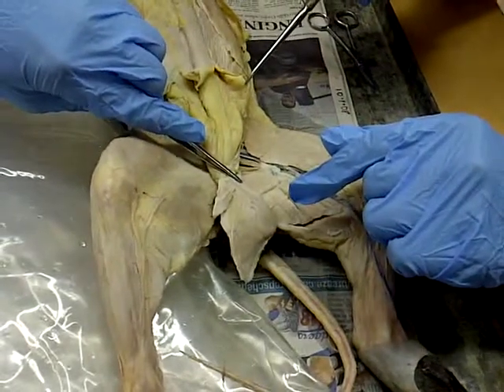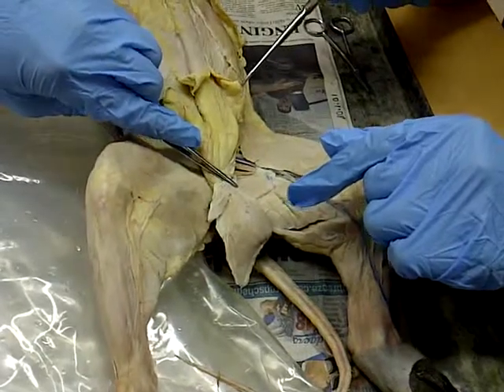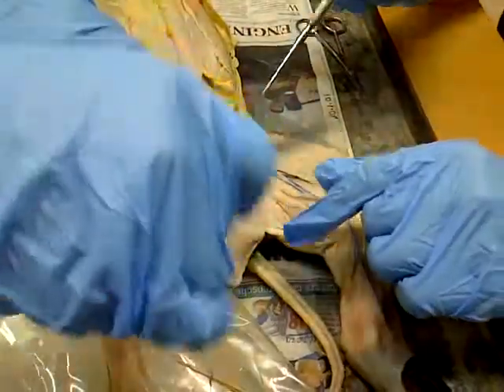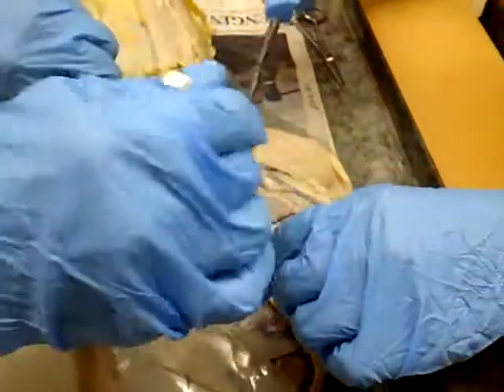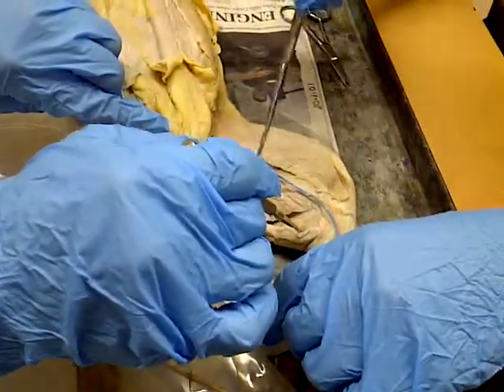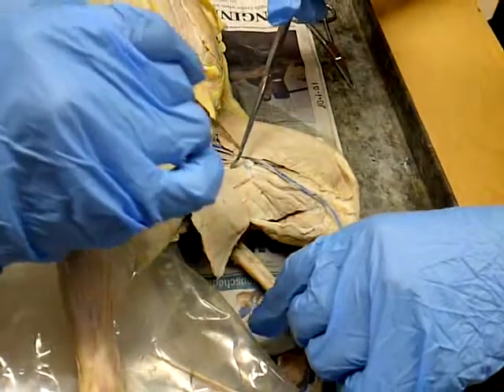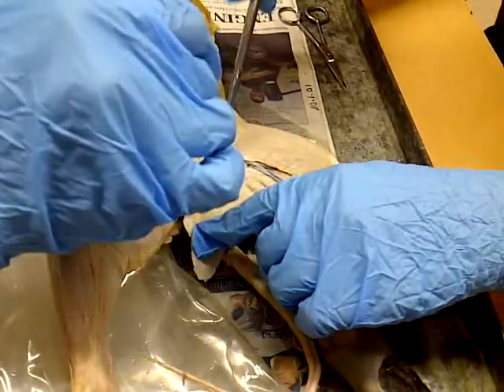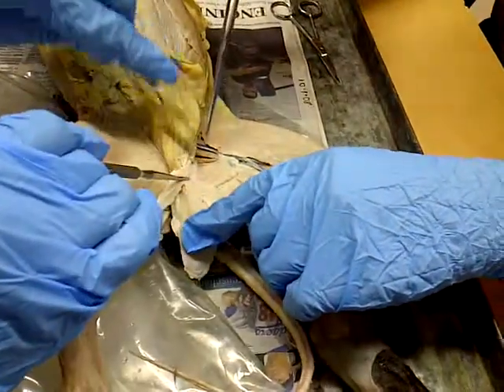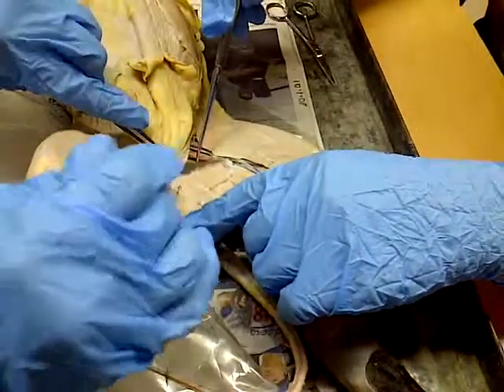Are we doing the posterior or anterior? No, it's the adductor femoris, that's not the rectus. Sorry, this is the semitendinosus, semimembranosus, and this is the adductor. Adductor, as in adding. Adductor femoris. Apologies. And there are two heads on the adductor femoris.